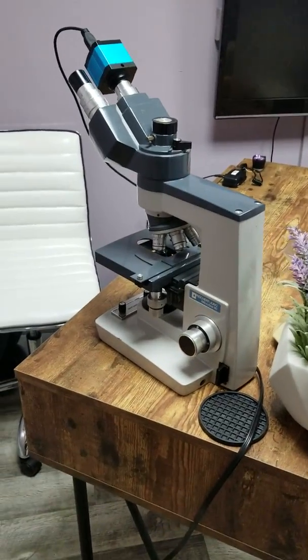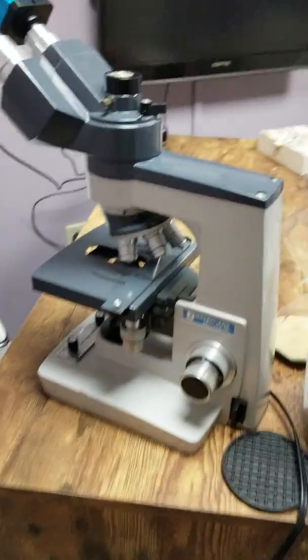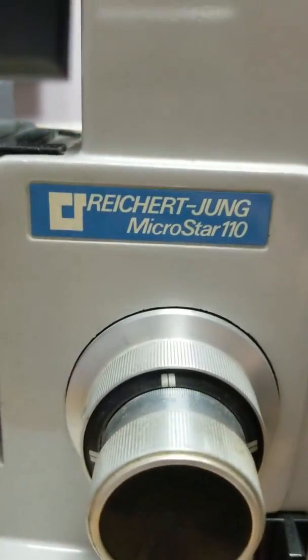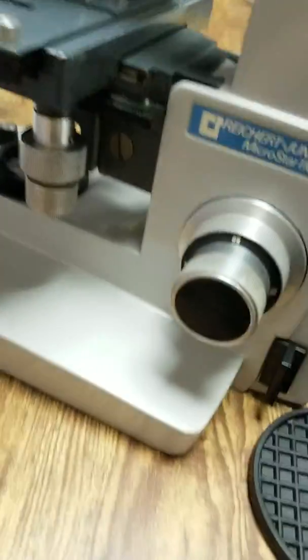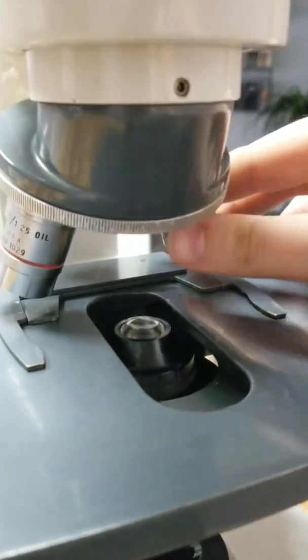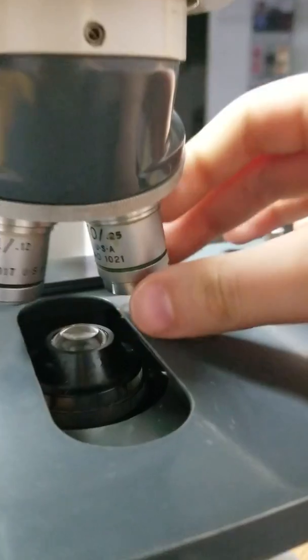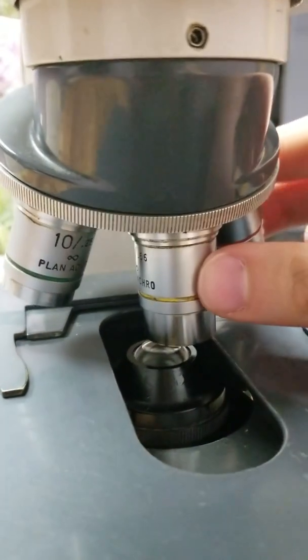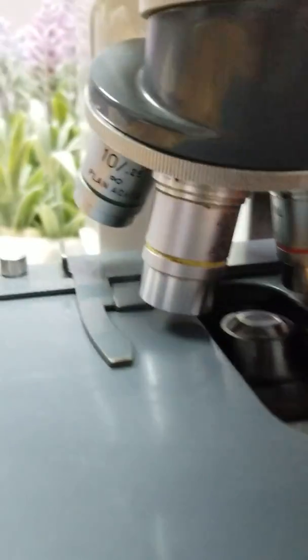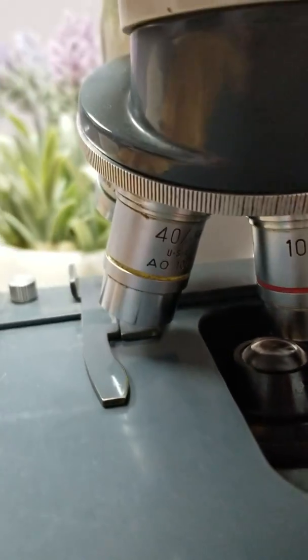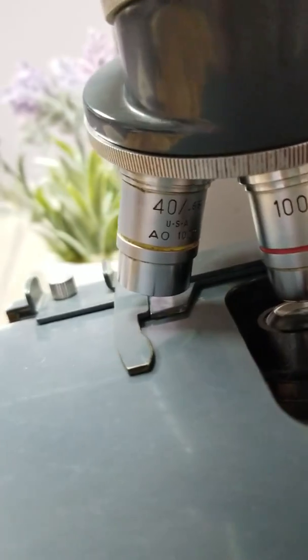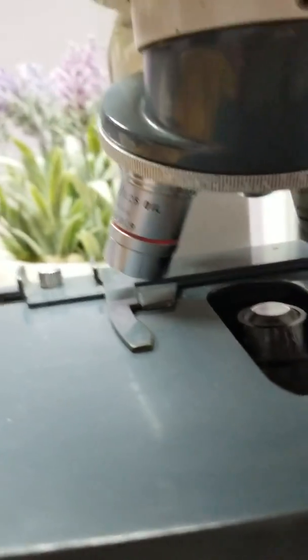So this is my live blood analysis setup. I have just a regular microscope, a regular light-field microscope. It's missing the last eyepiece, but it has the regular lenses on it. The 40 and the 100 oil. I usually just use the 40. It works perfectly for everything that I need.